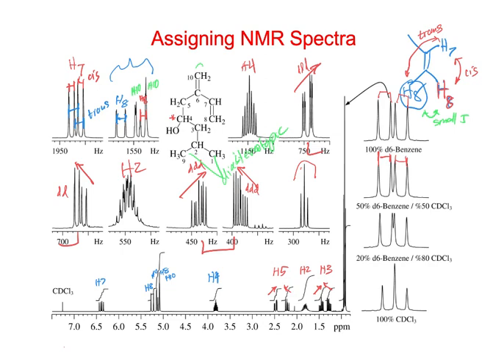I think that's just hard to predict. Yeah, that makes sense. We could put it in deuterated methanol or acetone or some other solvent too, and just see where the shifts are going to move. I think you just can't really predict that. Yeah, that makes sense.